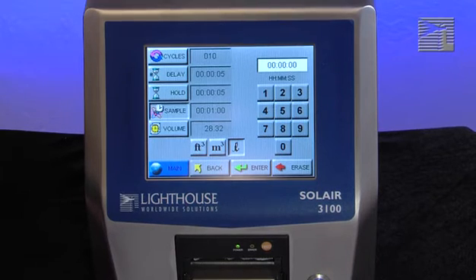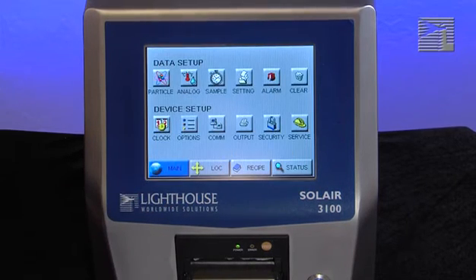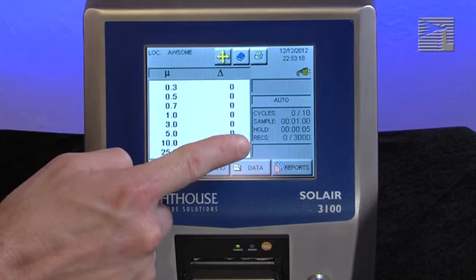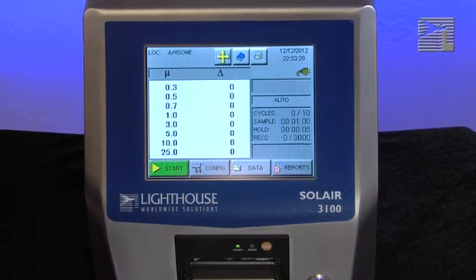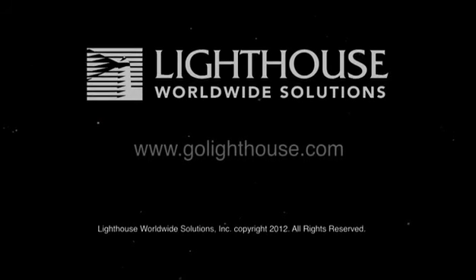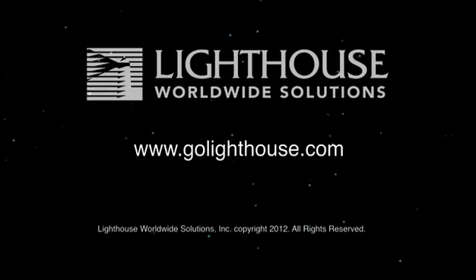Once you've selected your sample parameters, press the back button to return to the configuration screen, or press the main button to return to the main screen. On the right-hand side of the main screen you can review the sample parameters you have set — cycles, sample, and hold. That concludes the training on configuring the settings functions for the Solaire line of particle counters from Lighthouse. For more information on Lighthouse products, go to www.golighthouse.com.